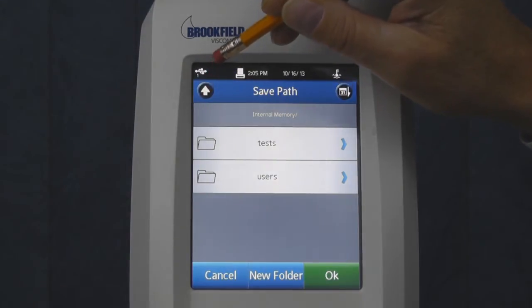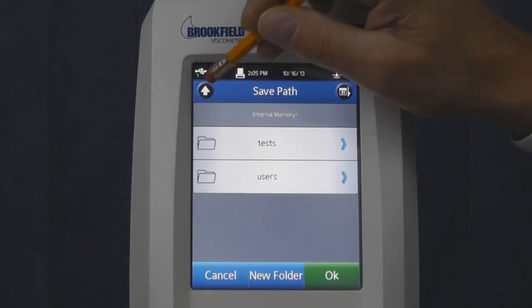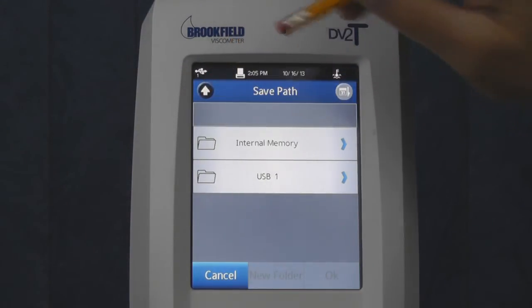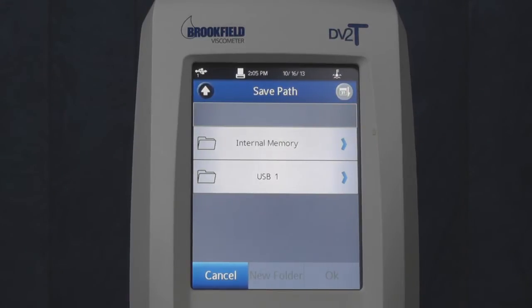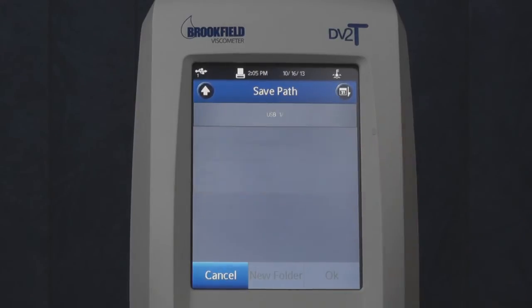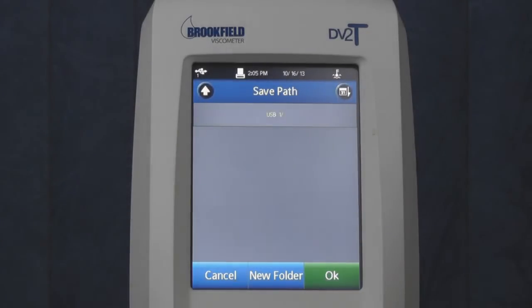To save the results to an installed flash drive, continue to navigate back until internal memory and USB is displayed. Select USB and then touch OK.